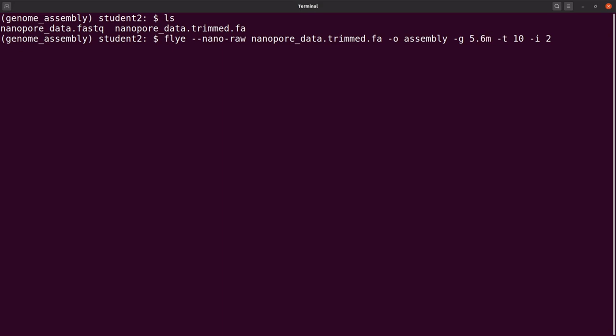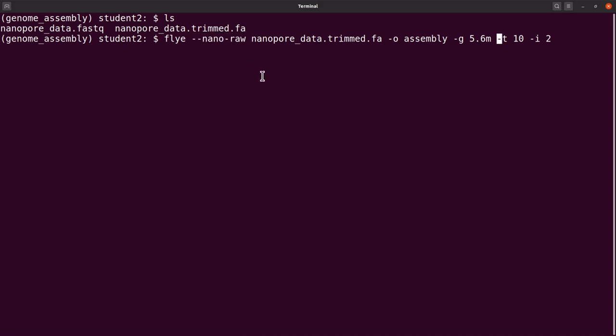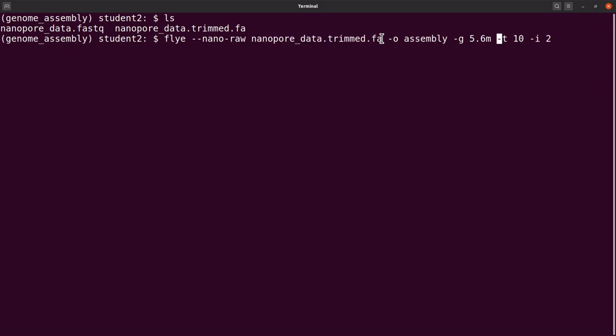Let me also say that with Flye you can also assemble PacBio reads. That is why this here is important, because this tells Flye which sequencing platform, and it will use the appropriate algorithms to do the assembly. So it's important to specify which sequencing technology we are using here.